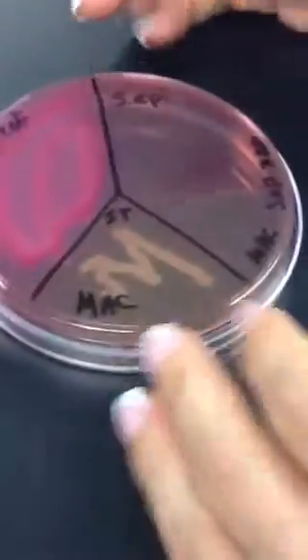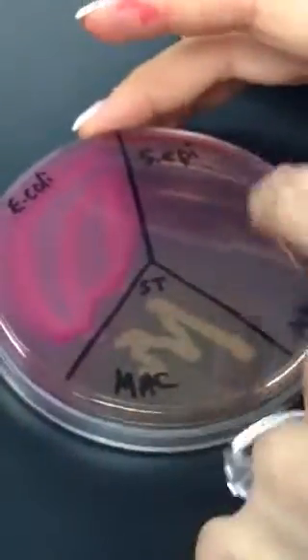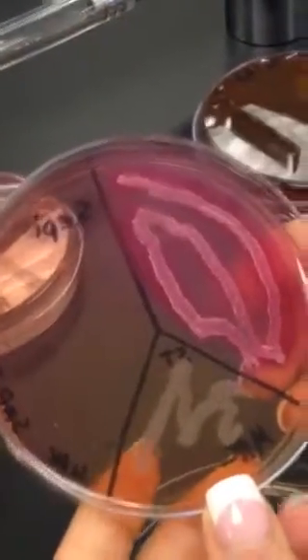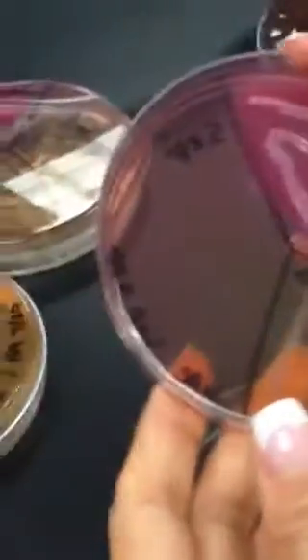Your MacConkey agar plate. This plate also has agar in it that inhibits gram-positive bacteria. So S. epi cannot grow. It selects against gram-positive, it selects for gram-negative enteric bacteria because it also has lactose in it, and a lot of them like it. And it's probably got sugars in it that they like.